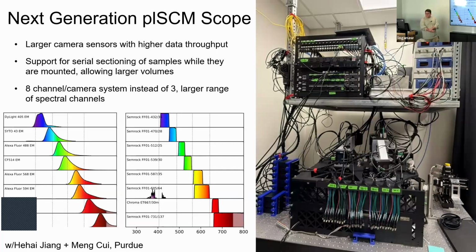Sure thing. If somebody wanted to get the system working in their own lab, what are some of the key hurdles? Is it the cost of the detectors? Does it take a lot of knowledge setting the system up? Yeah, so aligning it and physically building it is challenging. If you had a senior grad student who's experienced in optics, it's not that bad. But if you don't have someone in your lab who is an optics person, it would be pretty rough to even get the alignment down with the lasers.